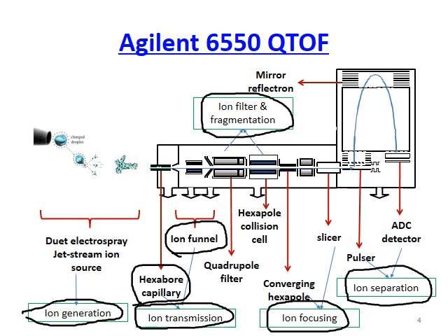After ions being transmitted, we are going to see the first quadrupole filter. You have known the function of quadrupole. So the first quadrupole is to filter ions according to some parameters set in your method. These settings are going to be used to select a specific mass range or to select a few particular ions.